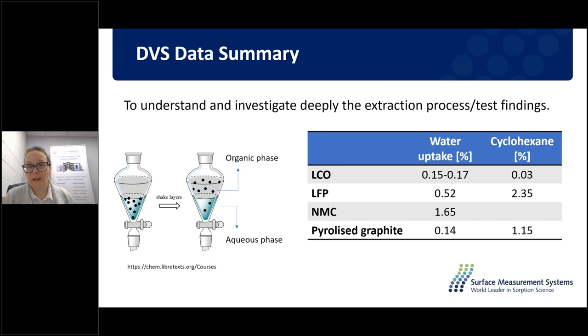Currently we are measuring the NMC cyclohexane sorption and desorption curve, and after that we'll continue with the other samples to get really the whole picture about all the different lithium metal oxides and the different graphite samples. But so far, the DVS data shows similarity with the wettability test or the extraction.